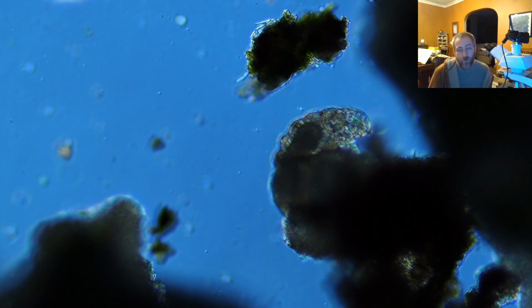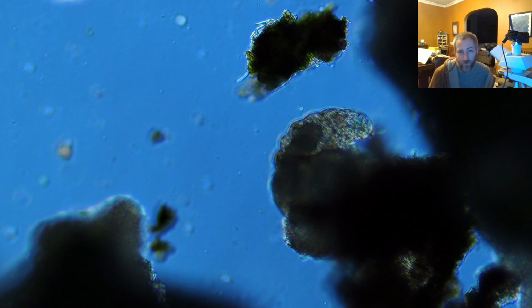So I think there's a range in their tolerances, and not all the water bears actually will go into that cryptobiotic state. It's not uniform across all the species that they can all survive crazy conditions.